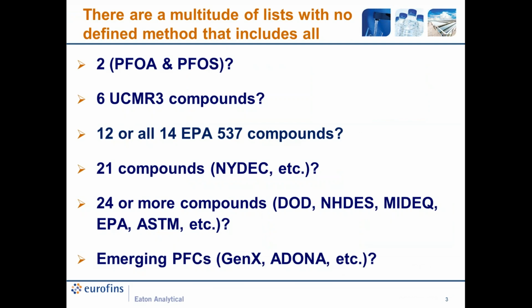One of the main difficulties for the commercial laboratory with PFAS analysis is that there are no defined regulatory methods, no maximum contaminant levels, and no consistent list of analytes between states. Which method do you run? As a drinking water laboratory, it is our tendency to stick with EPA method 537. However, customers request additional compounds and lower detection limits than are listed in method 537.